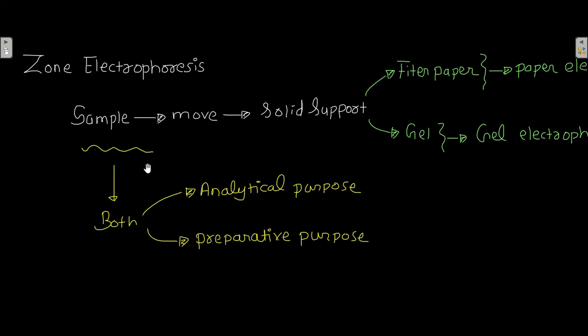And this technique, zone electrophoresis, is used for both analytical purposes as well as preparative purposes. So that is what the introduction to electrophoresis is all about.